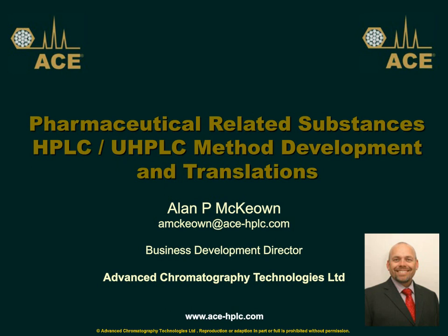Okay, thank you for the question. No, I definitely did not mean chiral as a mechanism, stereoisomer type interactions. What I meant with shape selectivity is that depending on the characterization protocol that you use to understand your different columns and their bonded phases, the protocol that we use at our company is based on what's called the Tanaka protocol, and this uses a mixture of triphenylene and O-terphenyl, which give you an indicator value for what's termed shape selectivity.